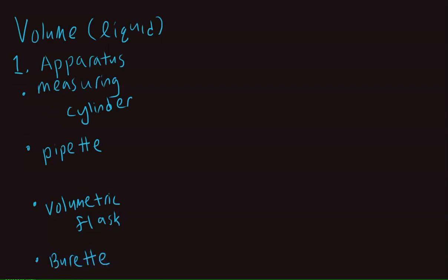Okay, so for the measuring cylinder, it actually looks like this. It's an open cylinder with a relatively flat base, and there's marking on it. So when you pour a liquid into it, it fills to a certain marking, and you can see how much you have poured in. Okay, for the pipette, it actually differs from different designs, but usually there's a bulge in the middle, and you can fill it with liquid through the whole tube. Okay, so that's a pipette for you.